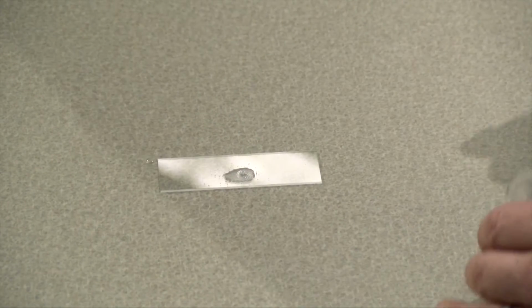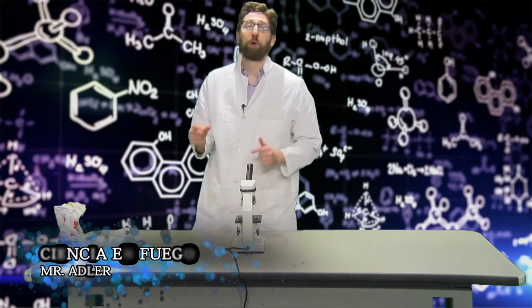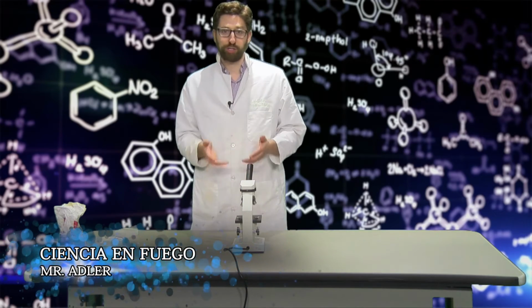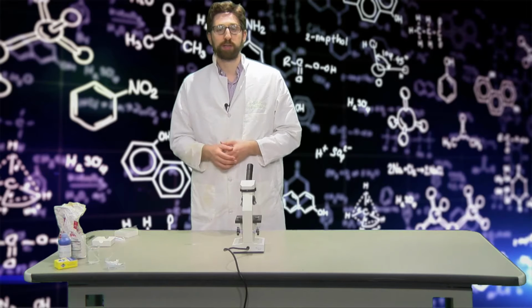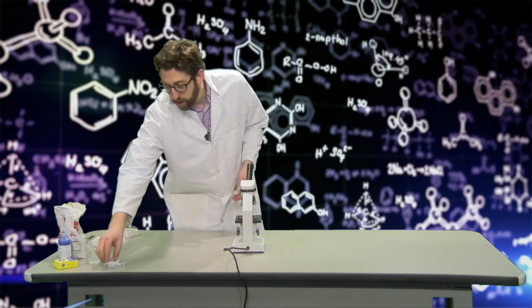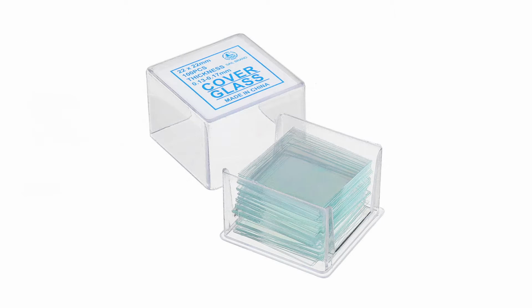There's one more step in making our slide. When I move my stage up and down, I don't want those lenses to hit the sugar, or I'm going to ruin my lens. Plus, I want to flatten out my sample to make it easier to see. So, on top of my sugar and my water, I'm going to put a cover slip.